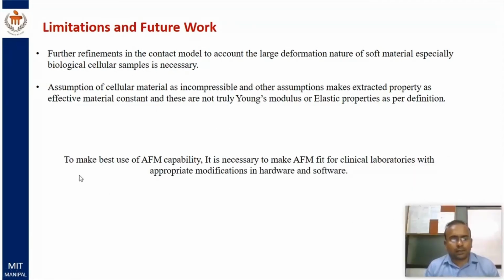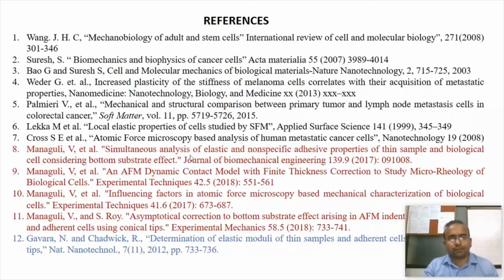Another thing is about taking the AFM to the next level and making best use of the AFM's ability. It is necessary to make AFM fit for clinical laboratories, to take them from research laboratories to the clinical laboratories. It needs appropriate modifications, and that's where we want to see the AFM in coming years. So that's all about this presentation, and these are some of the references.